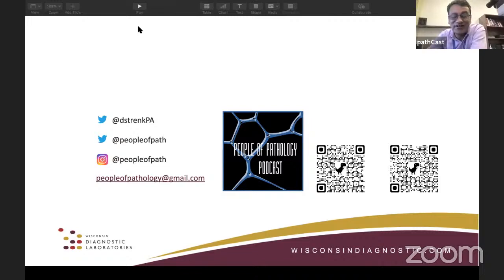Right. And so, yeah, those cancer protocols are really very useful. Another important thing that you have mentioned, and we need to highlight again, is the utility, or the importance, of gross description, that you have shown a template, right? Do you want to elaborate on the use of templates? Because sometimes, we have seen that if a new resident is using templates, that can sometimes get into trouble, right? Yeah, templates have positives and negatives.